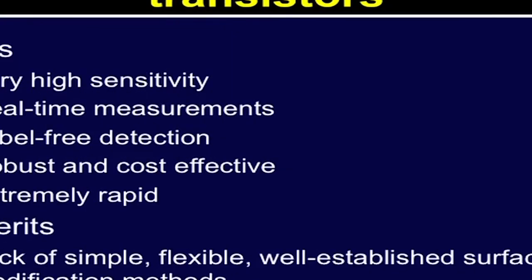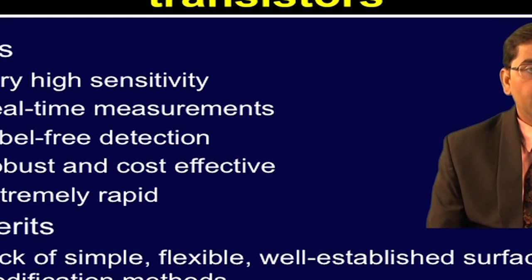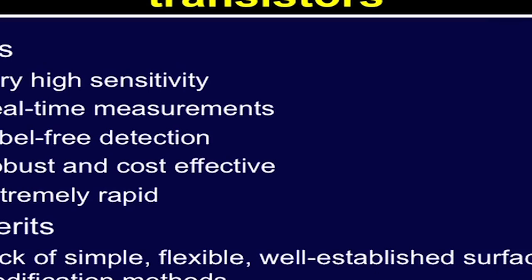This technology offers very high sensitivity with real time measurement capability. One can perform the assay in a label free environment where there is no need of adding a tag molecule. It is a cost effective and robust platform which is extremely rapid as well. At the same time, there are many demerits which are associated with CNT FET platform, including the lack of simple, flexible and well established surface modification protocols. When we talk about application of these nanotechniques as an array platform, then this particular platform is difficult to construct for high density arrays.